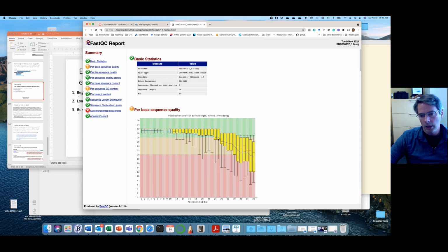And here, like I was talking about earlier, is the standard profile, right? Nothing surprising here about Illumina reads. It's got it color coded, right? Good reads, or good quality scores, are in the green. Back up a step. On the x-axis is the position in the read. So these are 36 base pair long reads.